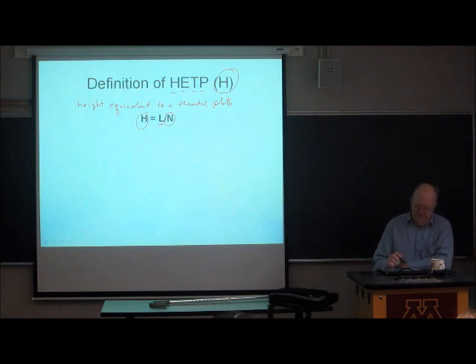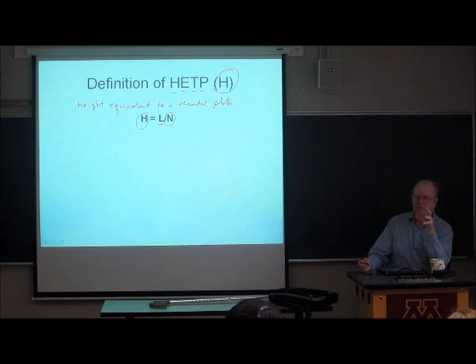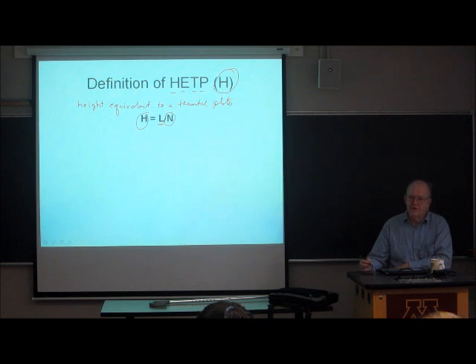Okay, now, what does N, or another related issue, what does H depend upon? One of the first things people found out that it depended upon was the flow rate, or the linear velocity of the mobile phase. And one of the earliest equations used to describe the HETP had the following form.